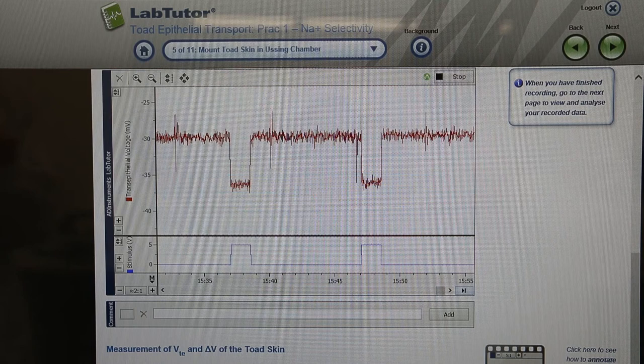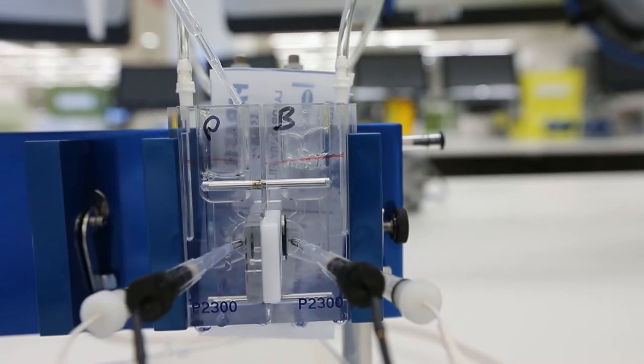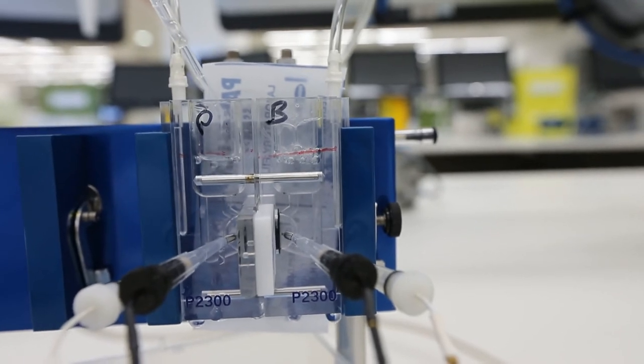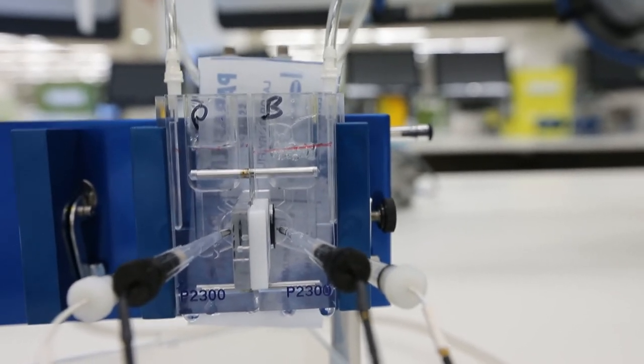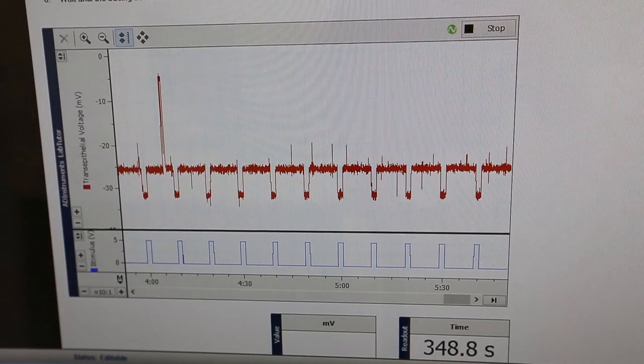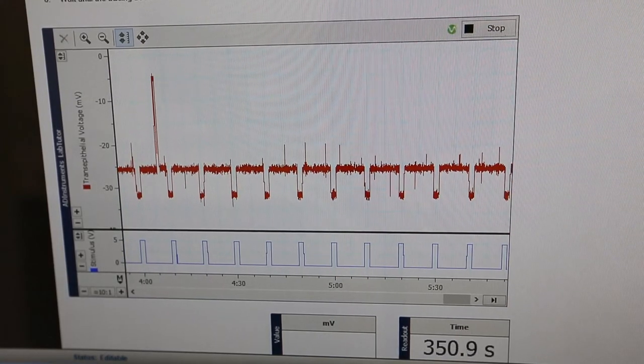Once you have finished your measurements, you can unpause the scrolling by pressing on the pause scrolling button in the bottom right-hand corner of the screen. Periodically, remember to check the level of Ringer solution in your chamber and top up to the red line as necessary. Next, we will measure what's called the amiloride sensitive short circuit current.